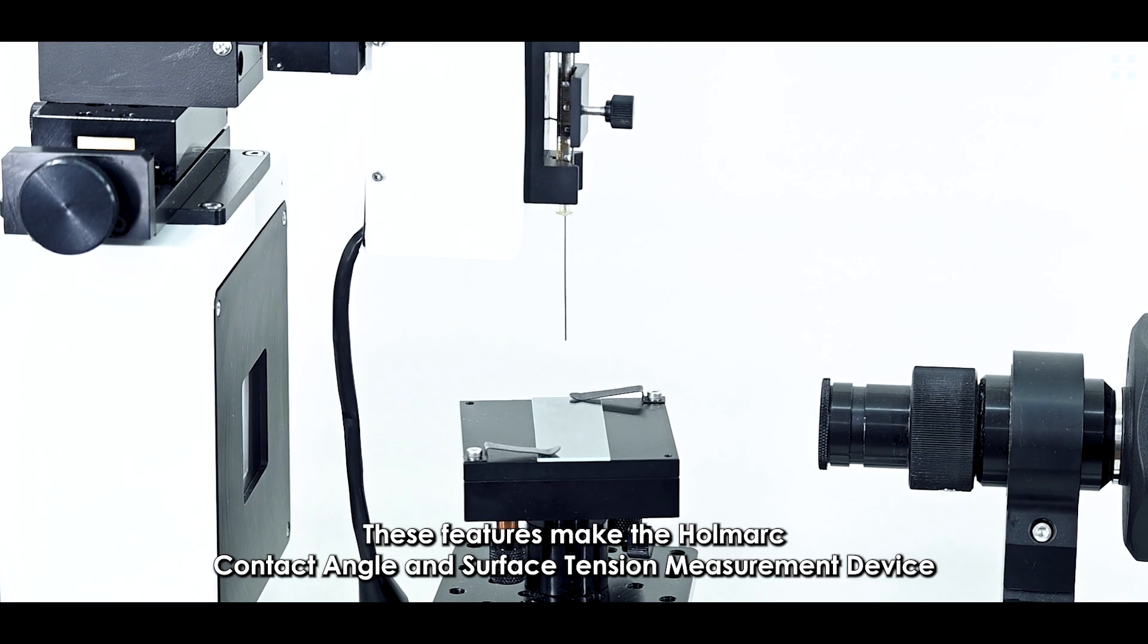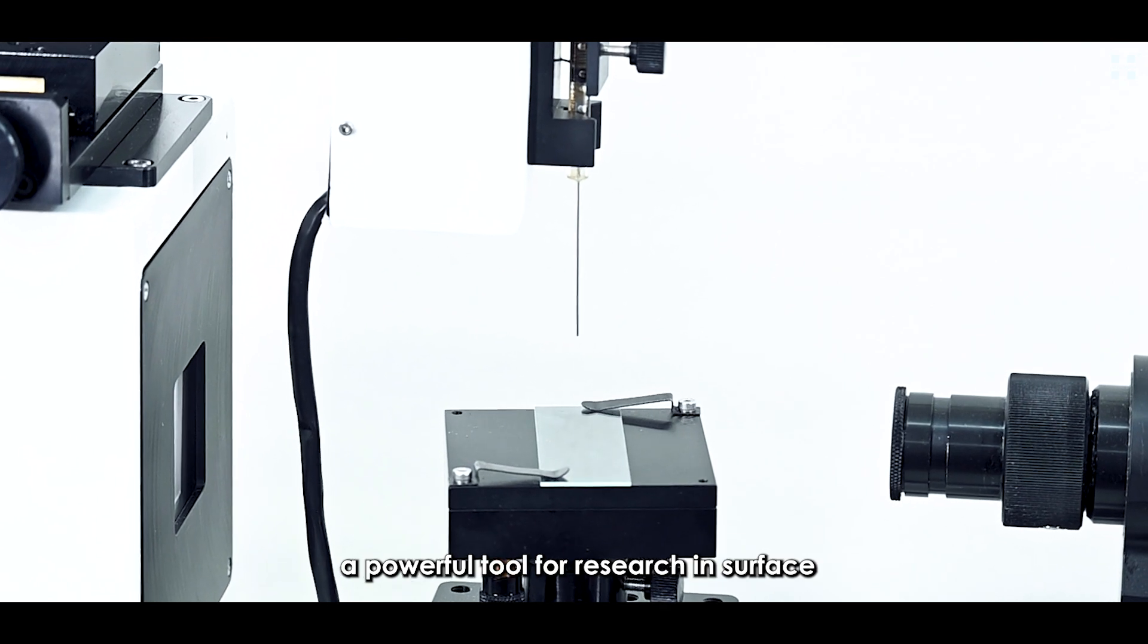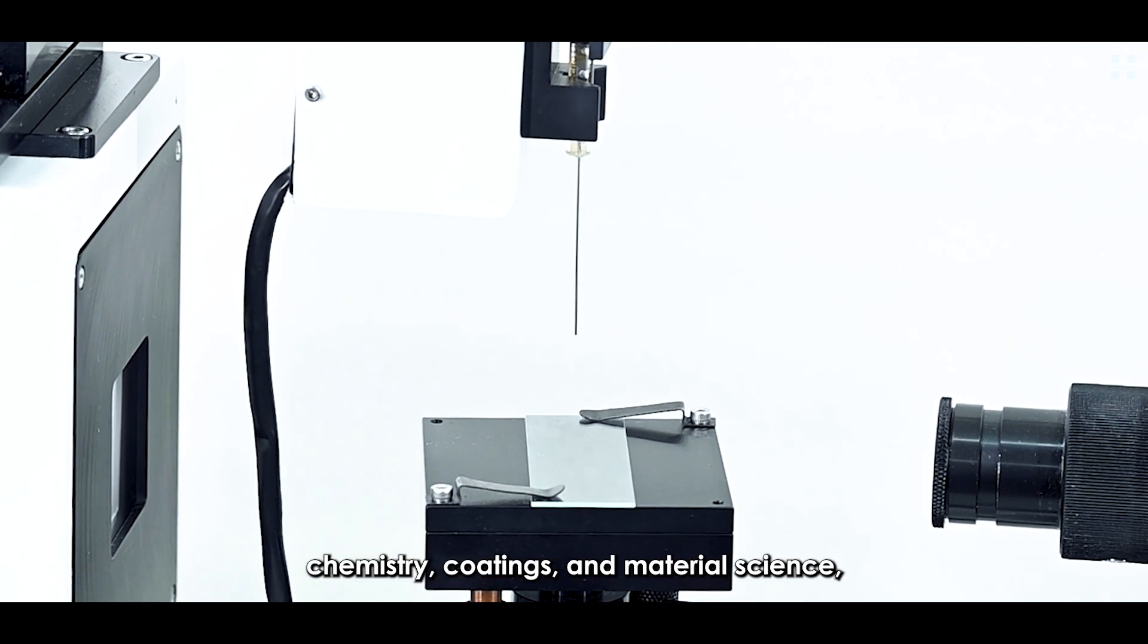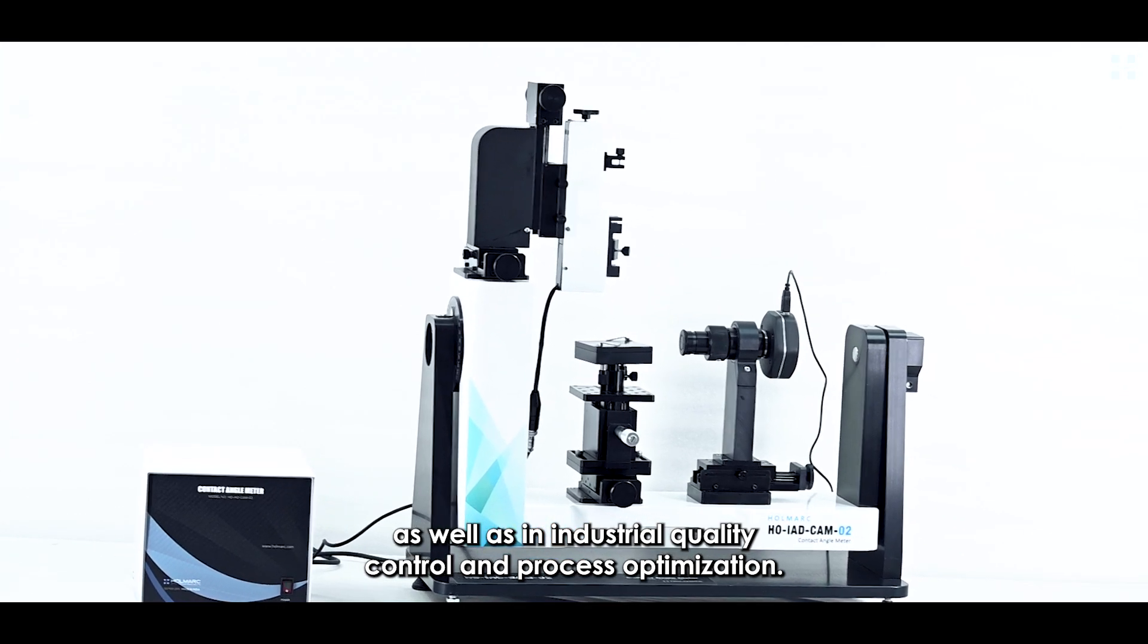These features make Holmark's contact angle and surface tension measurement device a powerful tool for studying surface chemistry, coatings, and material science, as well as for industrial quality control and process optimization.